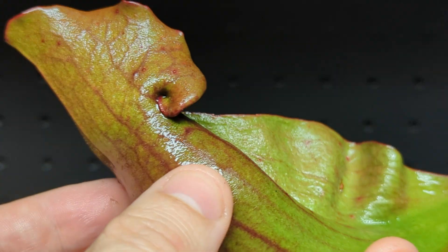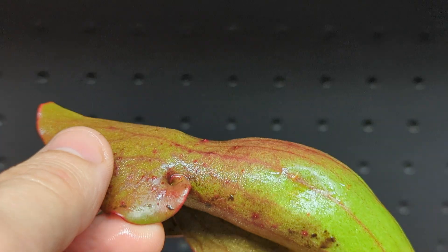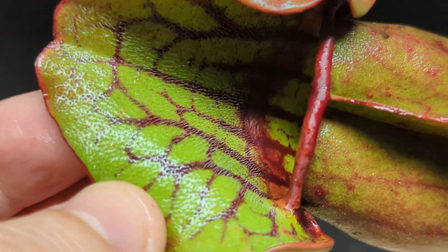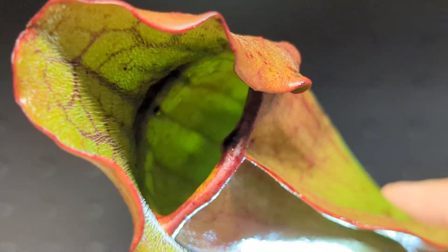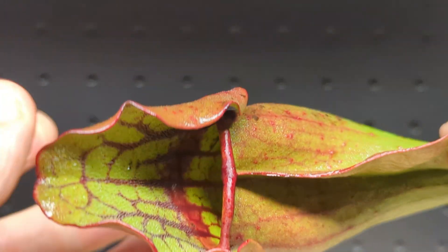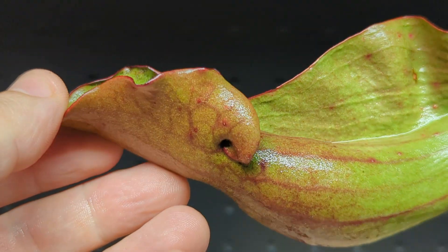My last video was on the organisms that live inside this pitcher plant; today we're going to dissect it and look at a genuine scientific mystery. Take a look in there — you can see the walls inside look smooth. You've got these downward-pointing teeth on the hood, but inside the pitcher itself it looks very smooth. I almost feel bad cutting into it — it's such a cool specimen.